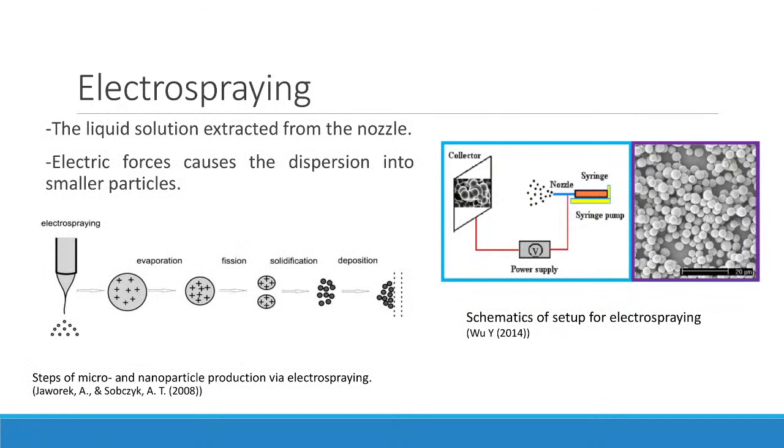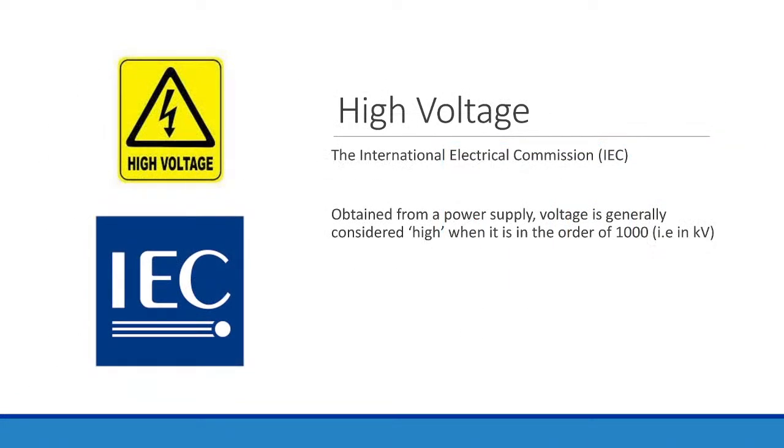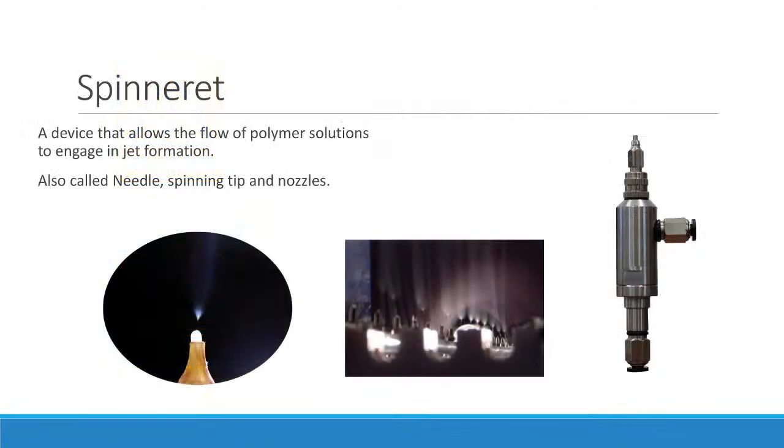Electrospraying is essentially very similar. They're sister processes. The crucial difference is that you don't get nanofibers, which are small cylindrical bodies. You get nanoparticles. So we can move on. I would like to mention that all of these processes incorporate high voltage. The machines have a high voltage range, and they are all being used. Next slide, please.